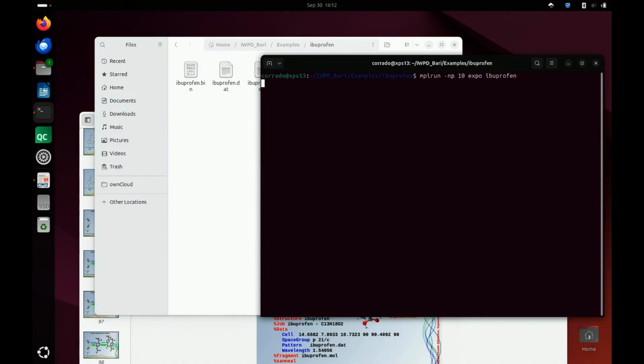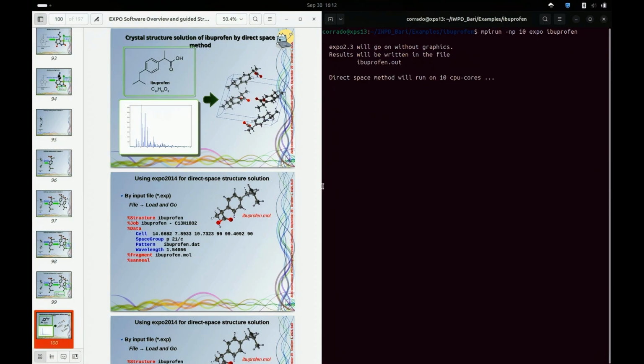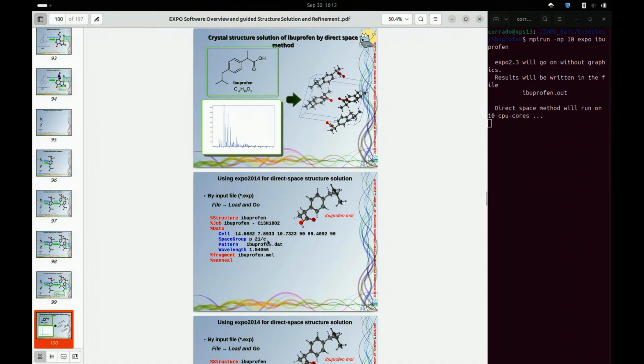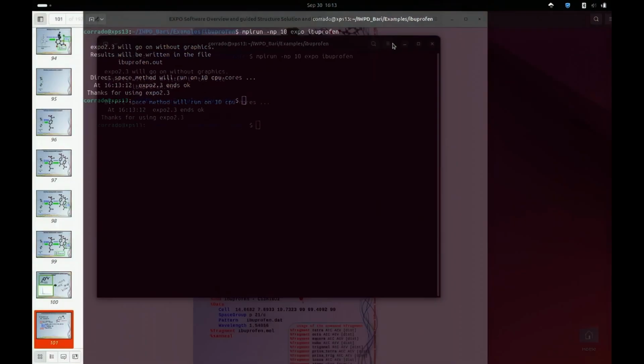Okay, so you run it, and I continue. Just a problem to zoom on this slide. Okay, just finished.